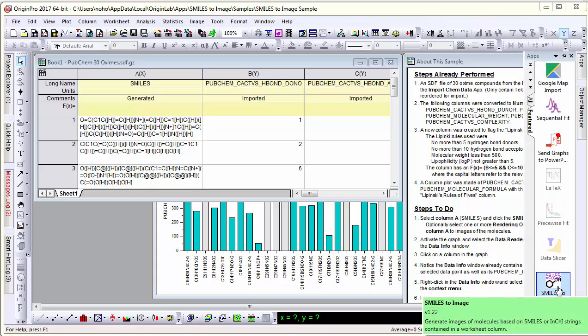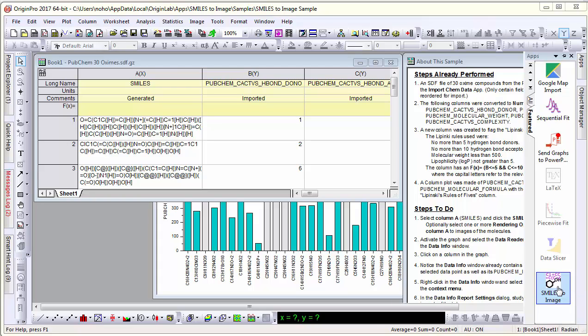The smiles to image app lets you convert smiles or inchy strings to molecular images.